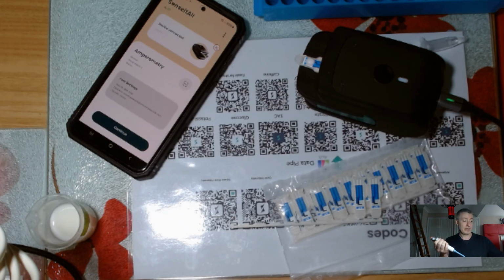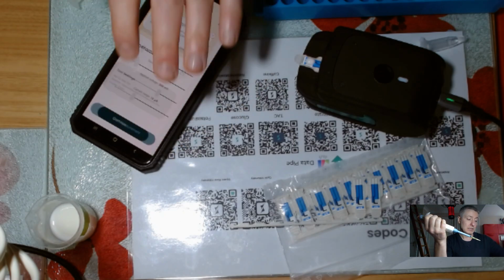At this point it was approximately 21,000 ppm, but I did a 1 in 10 dilution, which would have brought it down to more like 2,000 or 2,100 ppm. But in fact, what I'm going to end up doing is spiking this and bringing it to more like 20 ppm. I'm actually going to do quite a high dilution on this. So let me start the experiment.